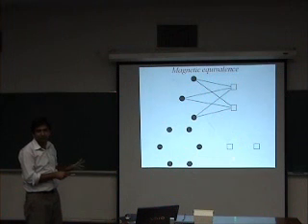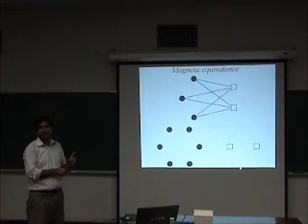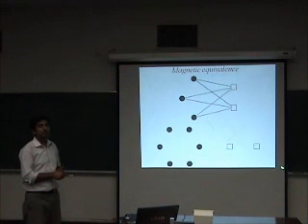Similar is the case for water. If we ignore the oxygen 17 isotope of water, there are no other spins to which these protons can couple. So not only are these spins chemically equivalent, but they are also magnetically equivalent.